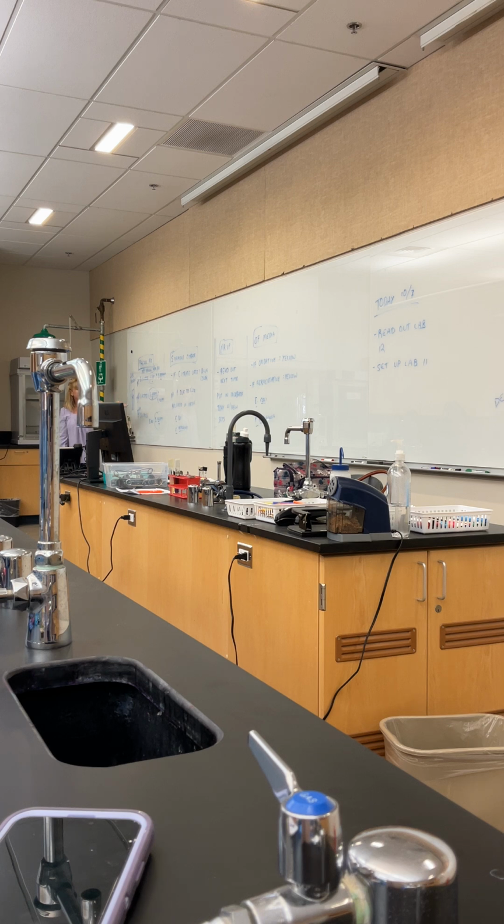So I can set these broths up really fast. I come in the next day, and if I see glucose positive, sucrose negative, that's a fingerprint for E. coli. Make sense? So this is how we're using them. We're using them to look for identification characteristics. What kind of sugars are they eating? What's their preference to survive? Because they're all going to look the same. This is going to help wanting to key them out. All right? Everybody with me on that? Okay, all right, we're gonna go on to the next one.